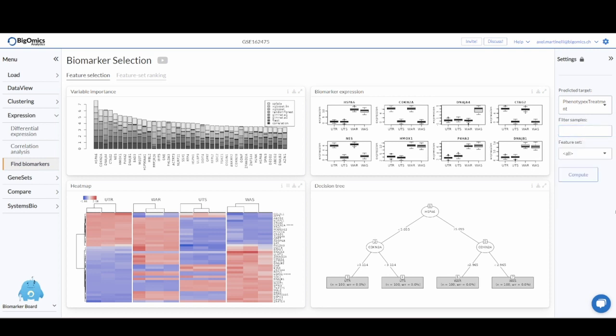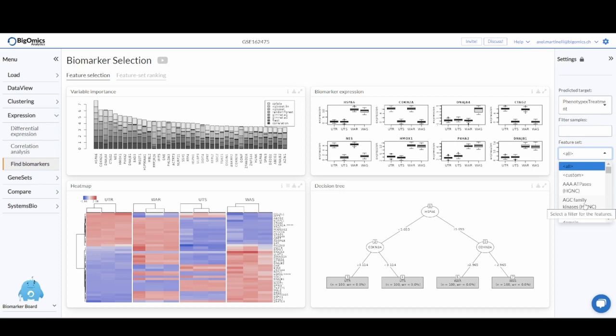You can also select whether you want to focus on all the genes or just a specific gene family.